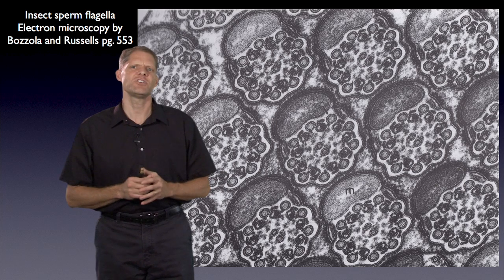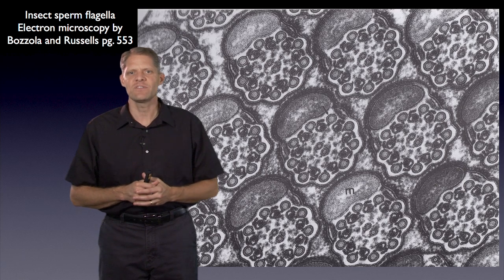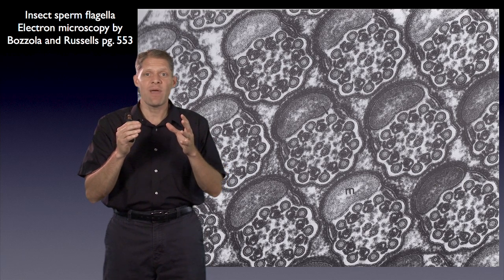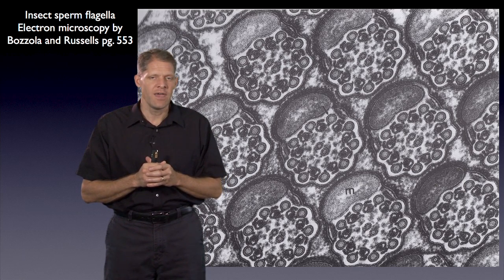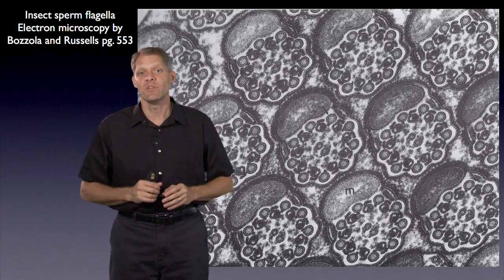While it's amazing that we can see even the individual protofilaments of a microtubule in this kind of thin section EM image, nevertheless, there are higher details that we can't get from this technique. For instance, we might wonder if we couldn't just zoom in with higher magnification on one of those protofilaments and see, for instance, where all the alpha helices are in the alpha-tubulin protein.